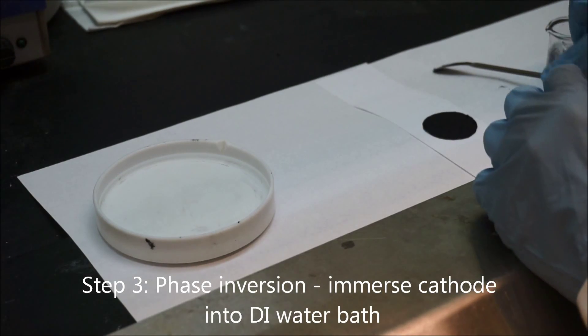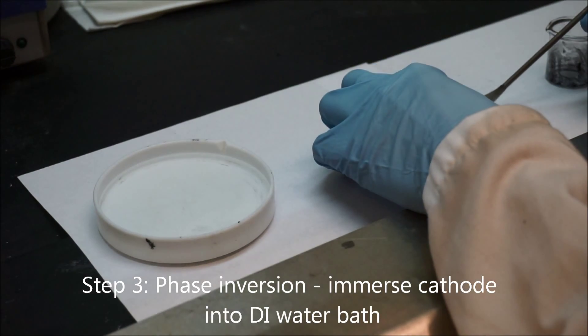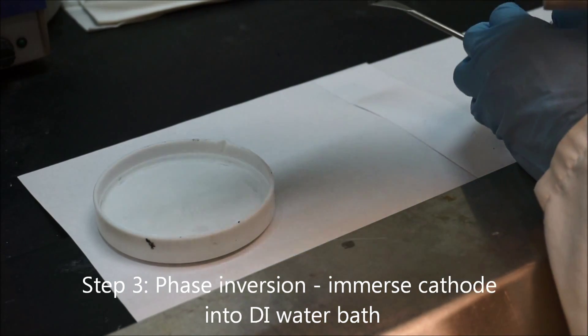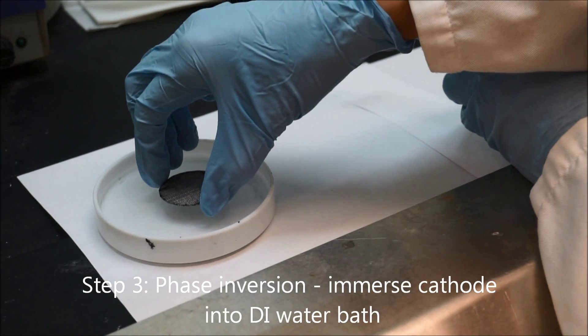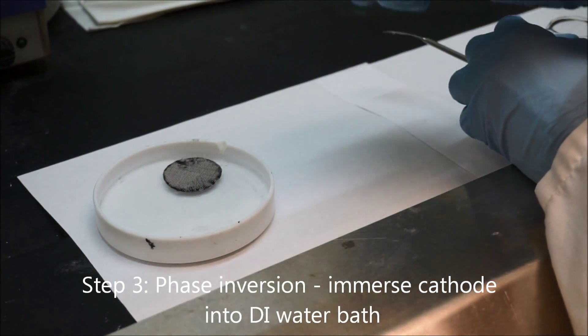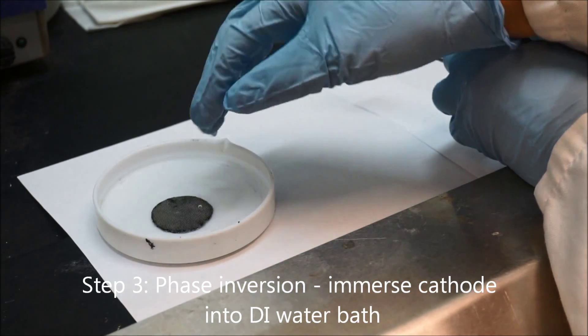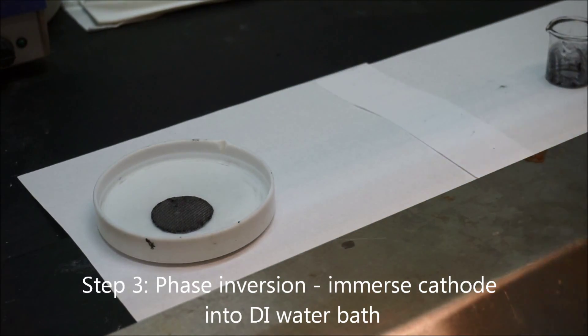After spreading the active carbon mixture onto the stainless steel mesh, the next step is to put the active carbon cathode into the DI water bath to go through phase inversion process. Remember to put the active carbon mixture side towards the bottom, and then leave the active carbon air cathode for 15 minutes.